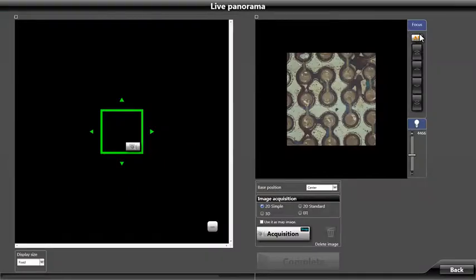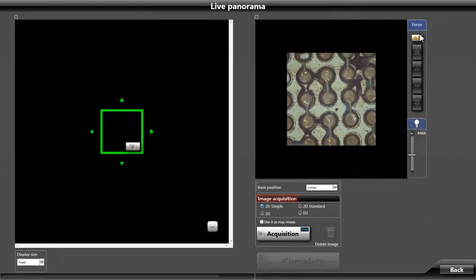After our selection, the Live Panorama window will open. This window will allow us to choose which type of image acquisition we would like to use.